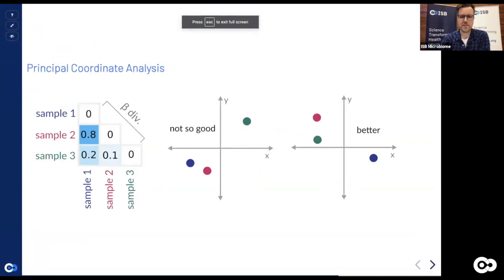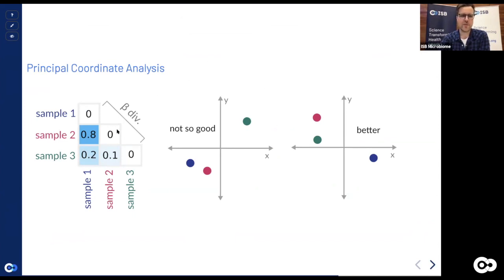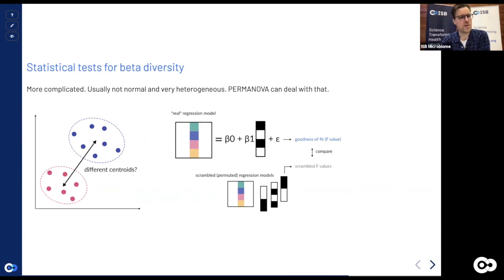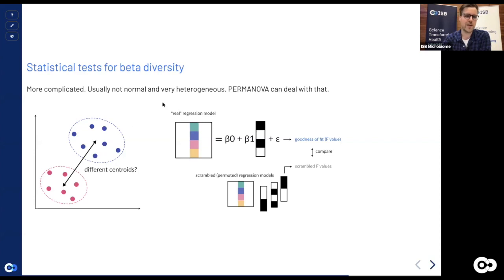So let's talk about that. We have a visualization, but now we want to test whether the separation we see in the beta diversity matrix is actually real. One thing you could imagine is checking if the centroids of those groups are very different. There's also a way to test it directly from the actual beta diversity matrix, which is nice because the projections don't conserve all the information in the data, so the projection might be slightly imperfect.